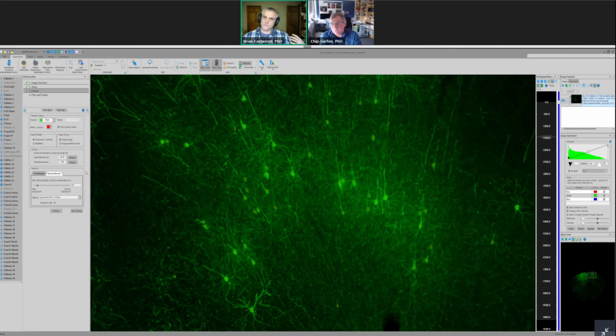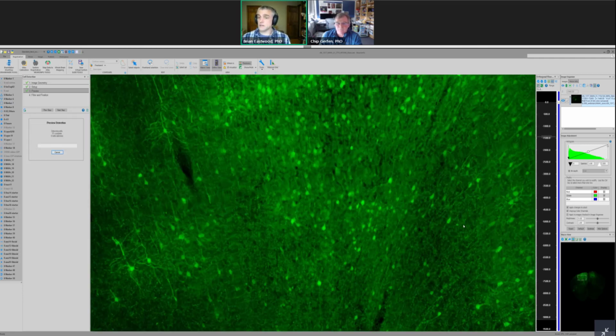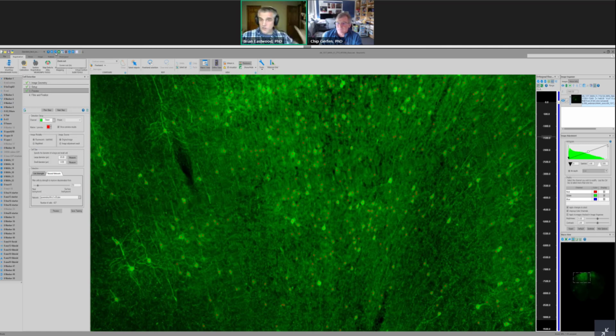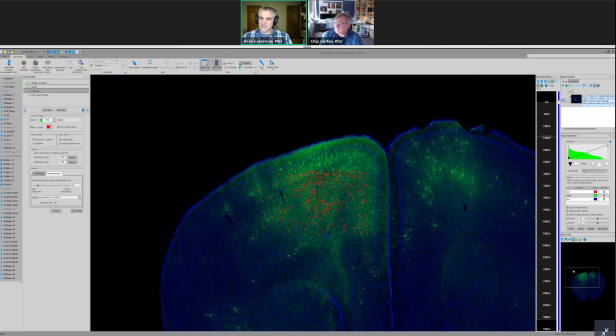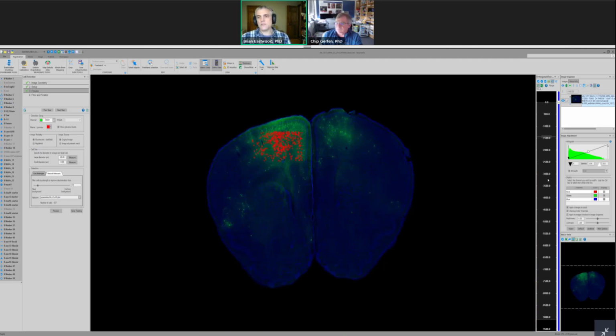So the labeling process involves looking at tons and tons of examples, fields of view like this, looking at the results that the LOG filter produced initially, and relabeling, basically correcting and saying, this object was missed, but it is a cell, or this object was improperly labeled, it's not a cell. And as I said, we have 90,000 and growing examples of that. The other thing, as I mentioned, is we have millions of parameters that we're adjusting during the training. That training process adjusts those parameters to improve how the neural network divides those example images into cell and non-cell groups. During training, we know the answer, right? That's why we need that labeled data: we know the answer we're looking for.